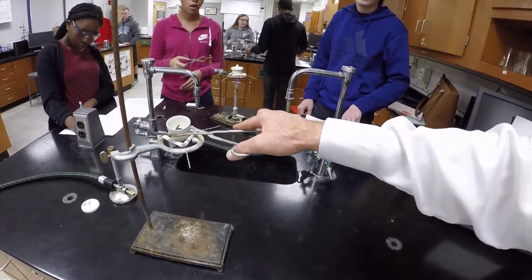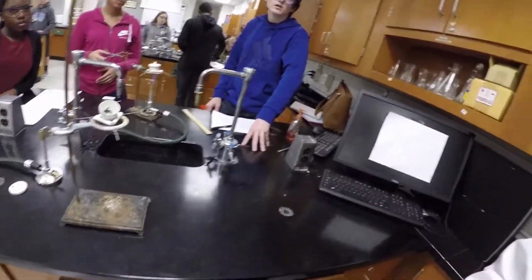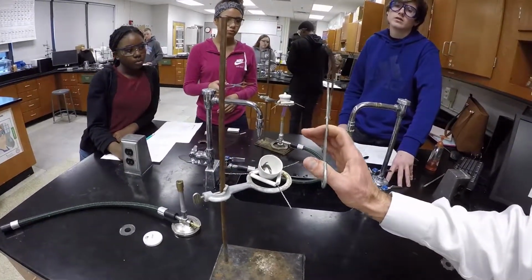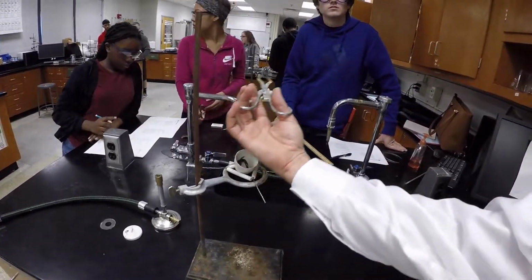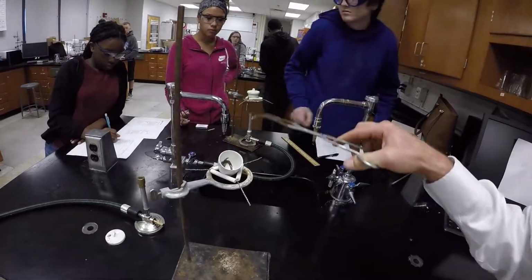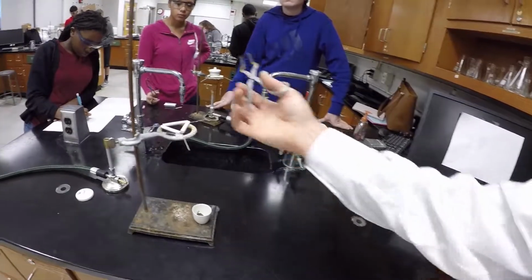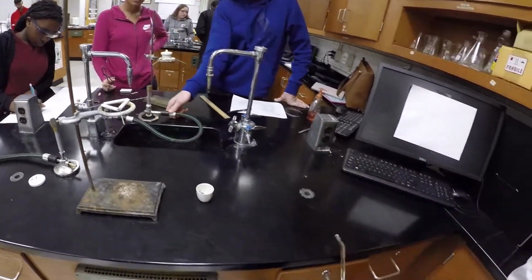No, you turn the gas on. I thought you're not supposed to put it on this because it changes temperature. You could, yeah, it's true. You're supposed to let it cool on this for a couple minutes, and then you're going to put your hand over it. When it's not hot to your hand, don't touch it. You should be able to feel the heat on it. Then you can take it off. You can put it on the ring stand like that. But by the time it's touchable, you should be able to put it on the table.